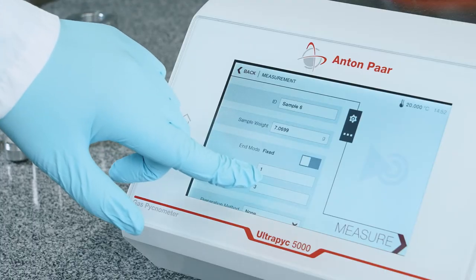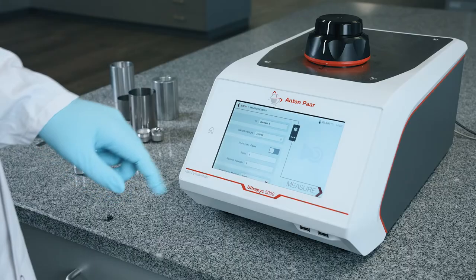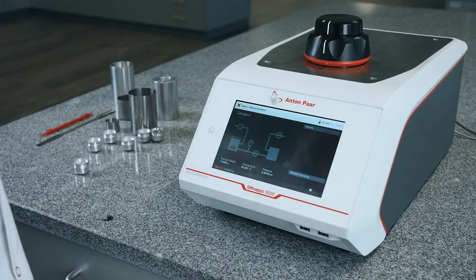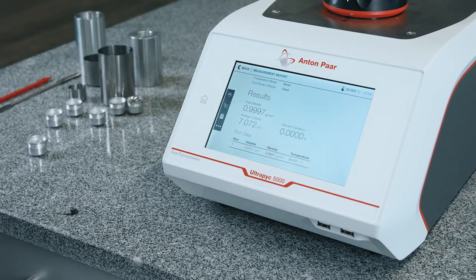After loading the sample, simply select the conditions for the density measurement and press measure. The large touchscreen has an intuitive interface. Viewing results is easy.